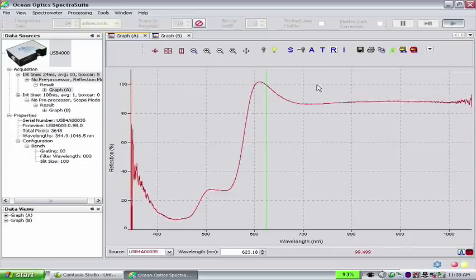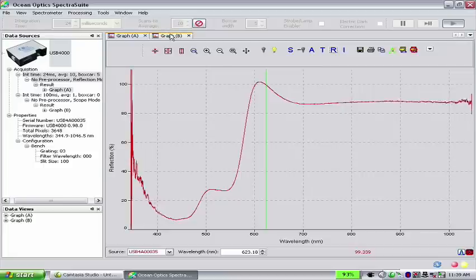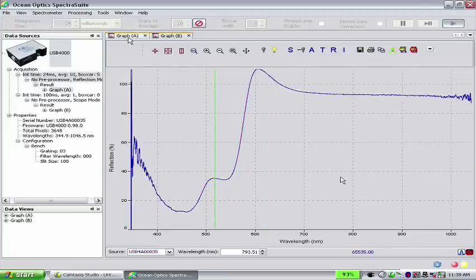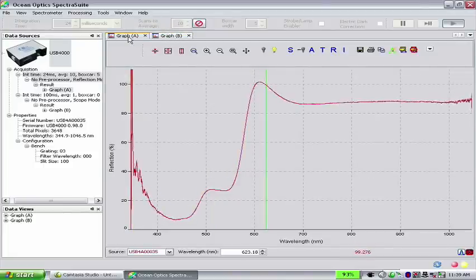Clicking back and forth between Graph A and Graph B tabs, you can see that the same reflection spectrum was obtained by both methods.